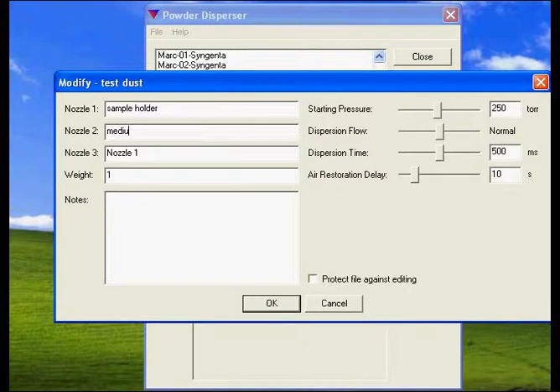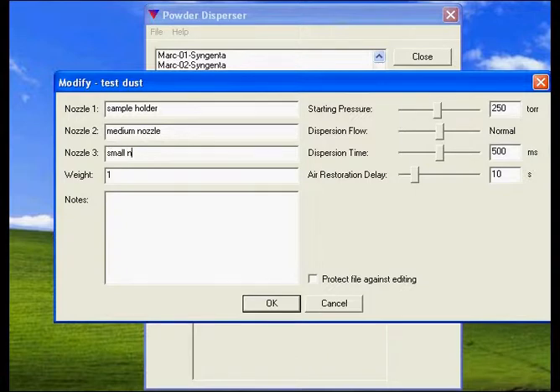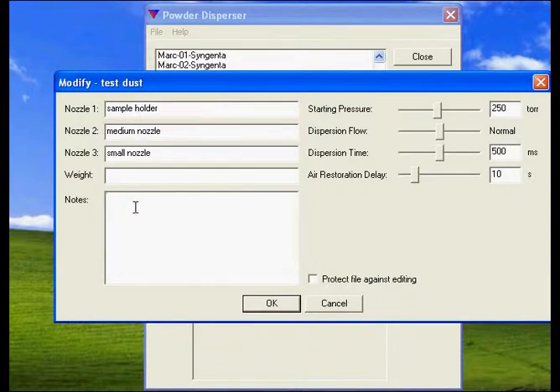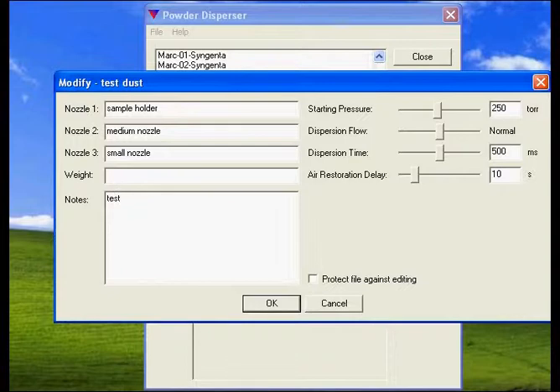Then I put the medium nozzle, followed by the small nozzle. You can put something here to help you remember what this test was for.